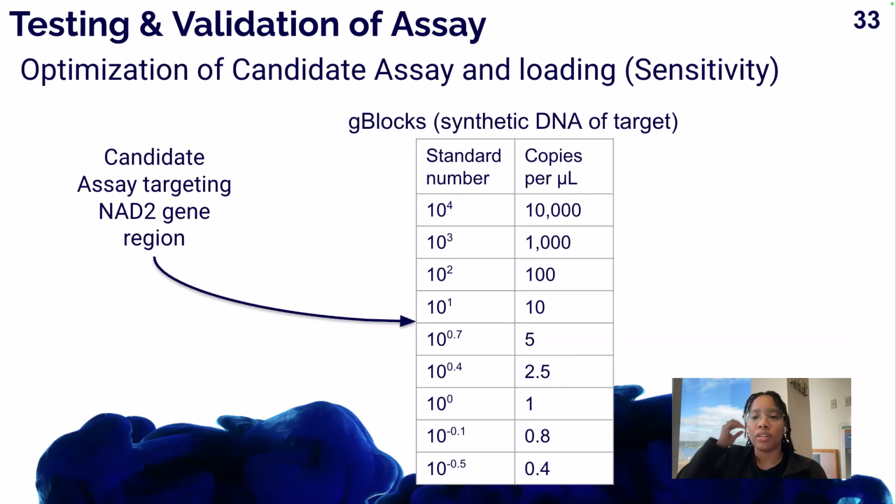And also, the benefit of using those gBlocks is so we can get that limit of detection and limit of quantification, so that we can then further assess the assay for its sensitivity and its specificity.